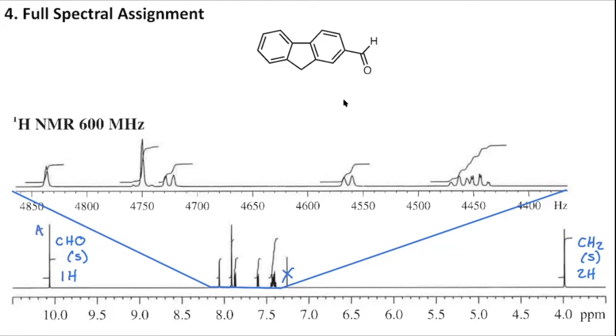You want to start at the very highest shift with A, then B, C, D, E, F, and G, all the way down at the bottom. So our zoomed in region only accounts for B through F. Let me translate those labels up to the top as well.